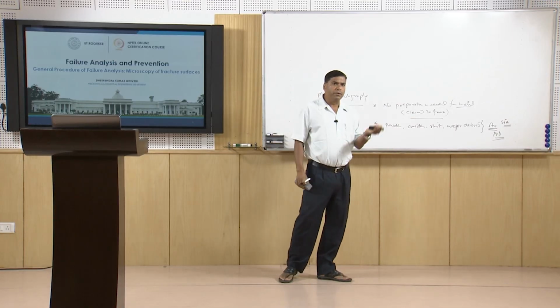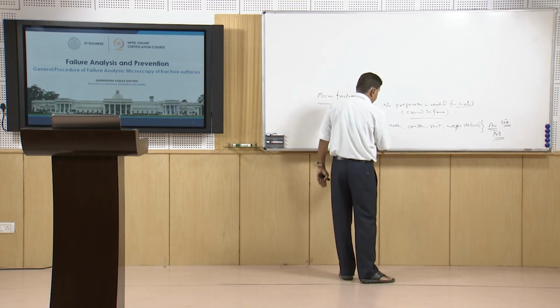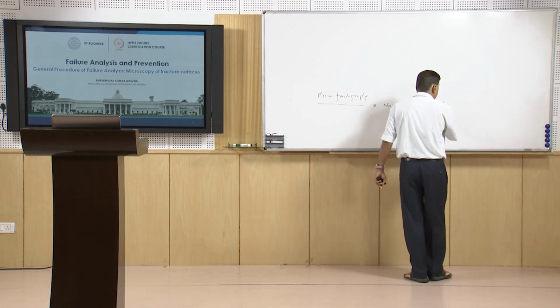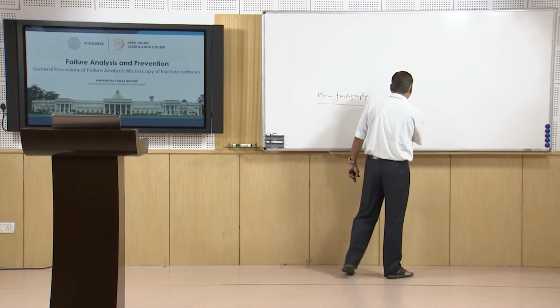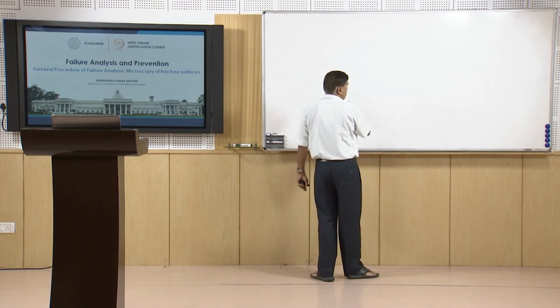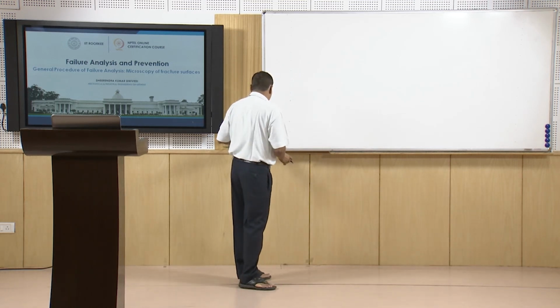So, in order to make the surface electrically conducting as well as providing good reflective surfaces, it is required that the non-conducting surfaces, if they are to be observed under the electron microscope, need to be coated with gold of a very thin coating thickness, just to make it electrically conducting and give good reflection for the electrons.